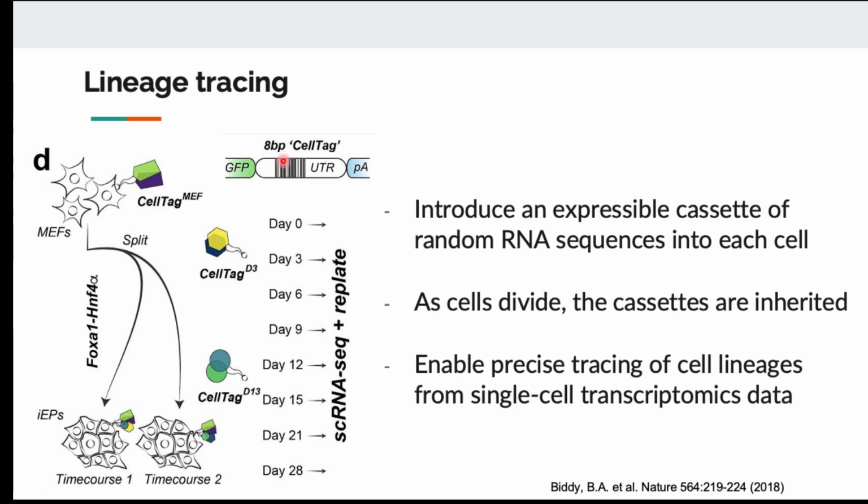So it will express this gene. But the gene sequence that each cell gets will be different. So when we run the RNA sequencing, we can detect the expression of this gene. And we can look at the reads, look at the sequence to identify the evolution pattern, because as the cells divide, mutations will accumulate in these nucleotides.